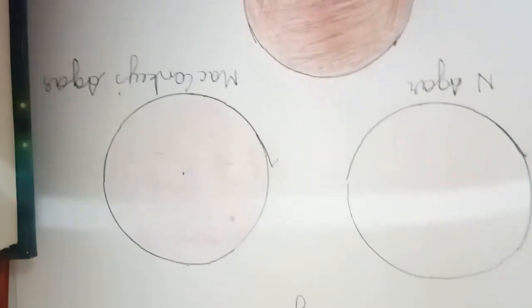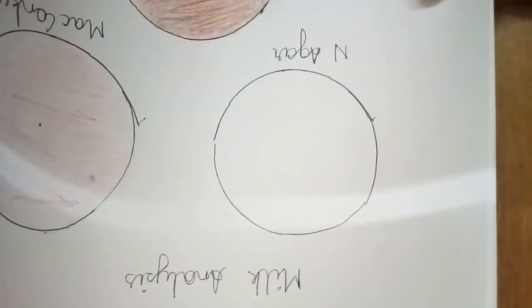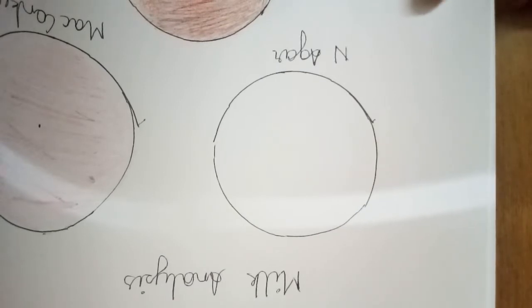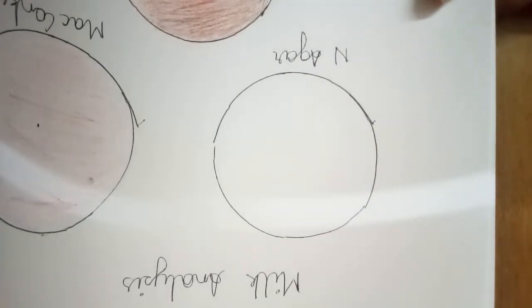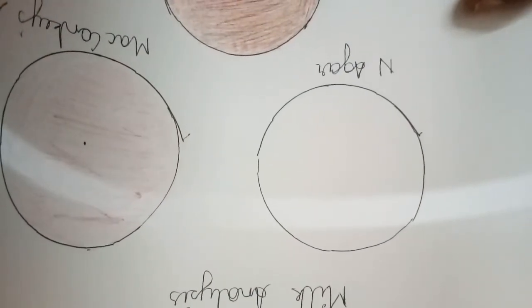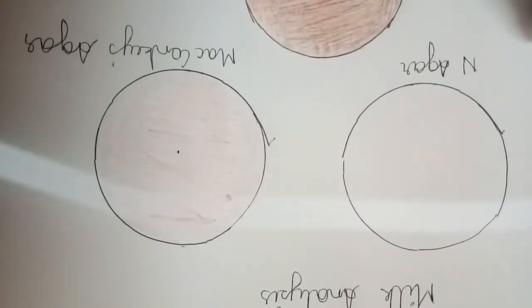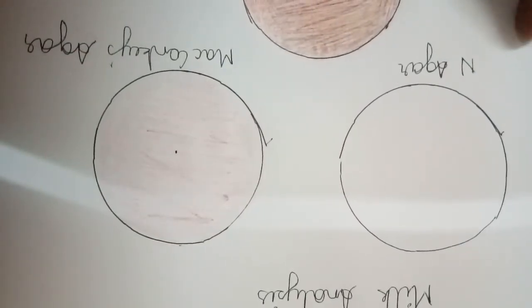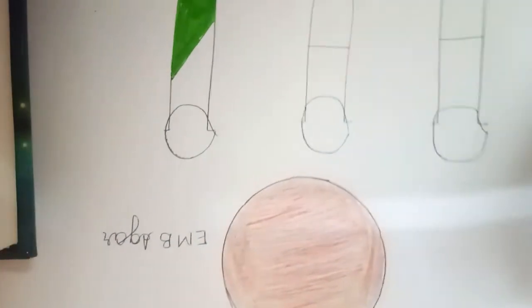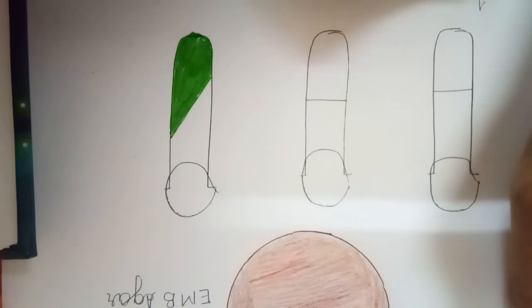Now in case of biochemical tests, we are going to perform 3 different biochemical tests. In first we have prepared 1% peptone, which is colorless or slightly yellowish. This is our GPB tube, that is glucose phosphate broth, and this is our citrate slant, which is already having parrot green color. Okay, so here we will write like this. Here very firstly 1% peptone.